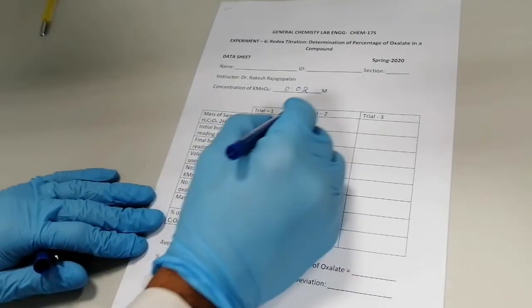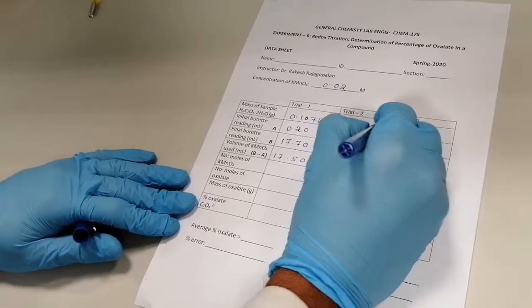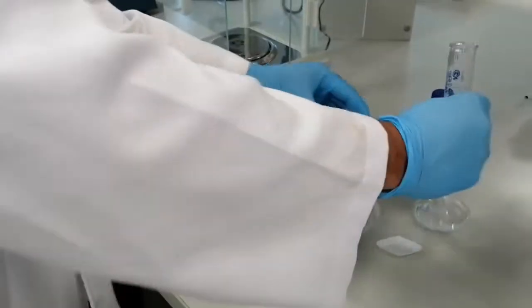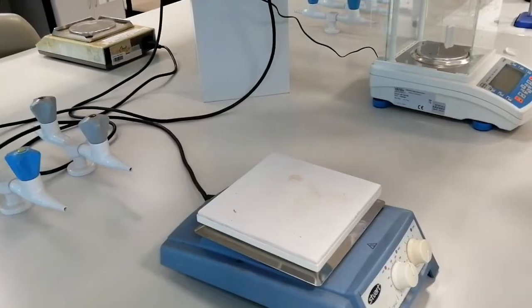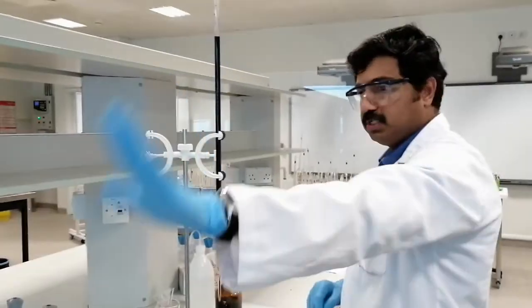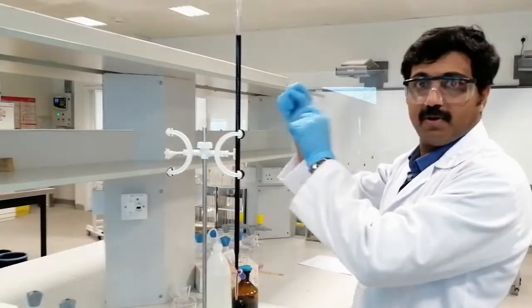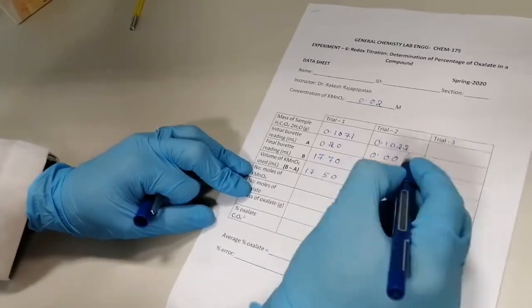For the second trial, the oxalic acid weight is 0.1022 grams. My 50 mL of sulfuric acid is ready, so I'll transfer it into the Erlenmeyer flask and dissolve the crystals. The crystals are dissolved. I'm going to warm the solution on the hot plate. Meanwhile, I've filled the burette back to zero, keeping the upper meniscus at 0.00. So the initial burette reading for the second trial is 0.00 milliliters.